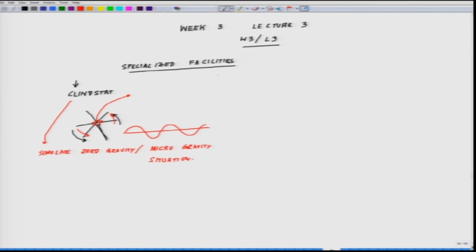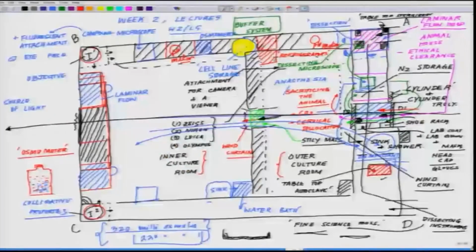Okay. So, if you have to have a facility like that within your system, you have to go back and see where you really can accommodate it. So, you have to have these spots which are left somewhere out here, for example. That is why I told you to leave space, you do not know where you may be needing things. Okay. Or say, for example, you have a space biology setup out here. This is one specialized setup you are adding into it.